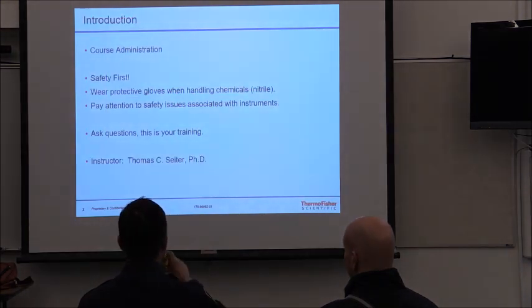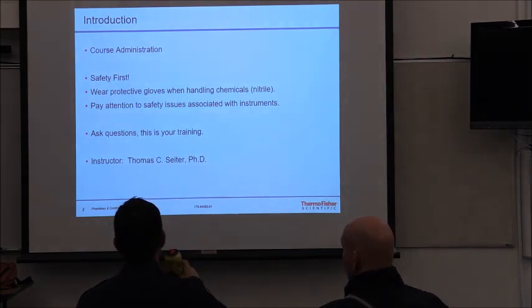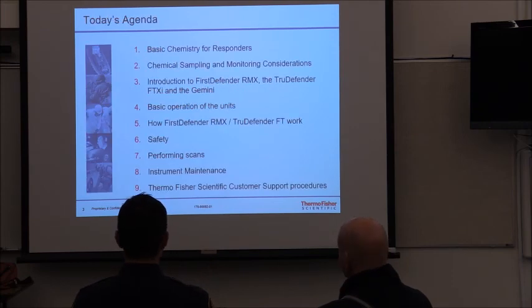Class safety first. If you do bring out chemicals, I do recommend and encourage you to wear nitrile gloves, just because I don't want you getting chemicals on your hands and doing some other weird thing. So ask questions. Go to training, ask questions of me. I don't care. Yell, holler, throw, spit, do something to get my attention.